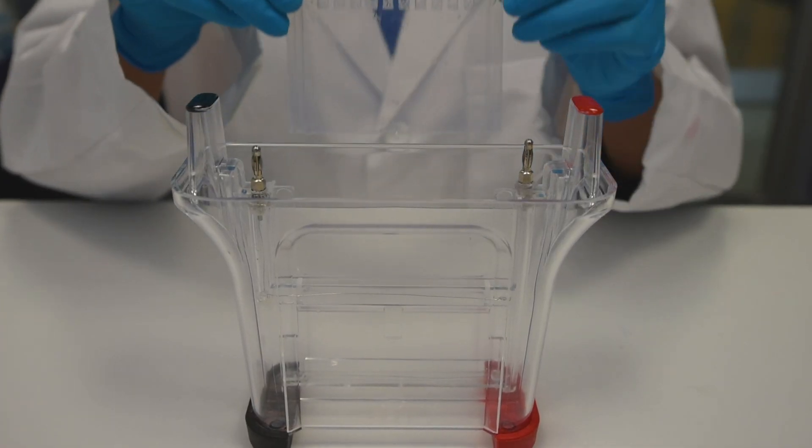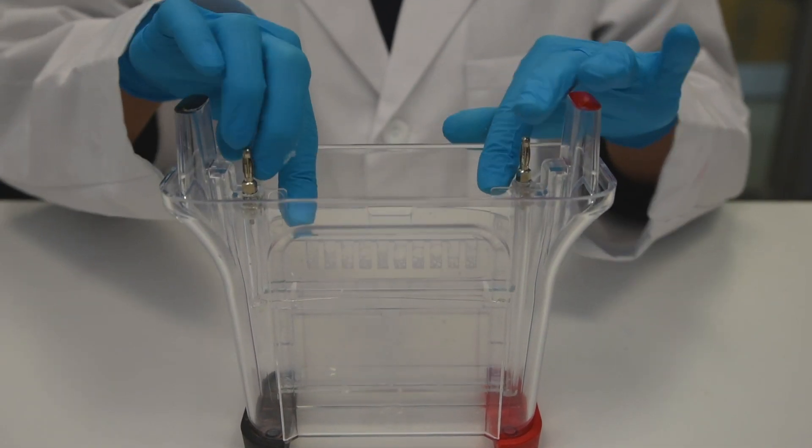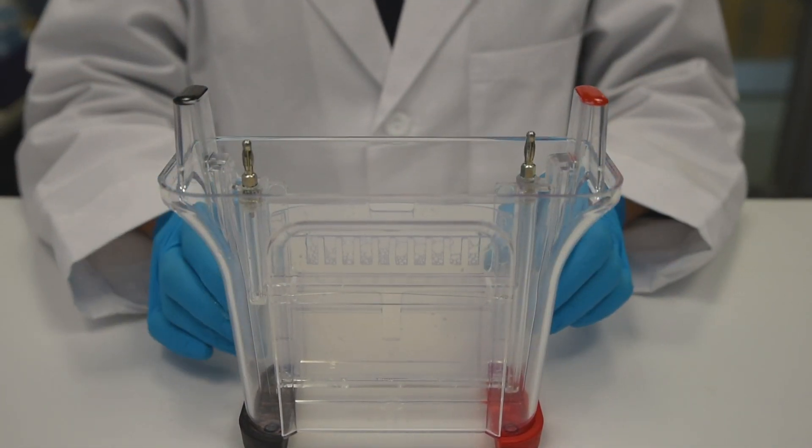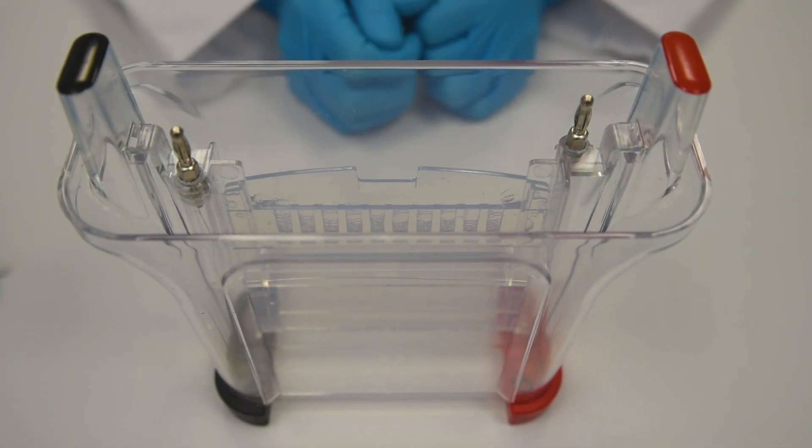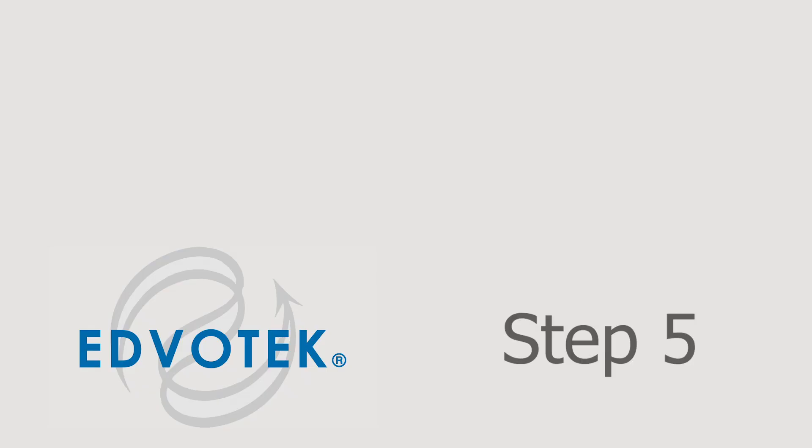Step 4: Insert the gel into the electrophoresis chamber. Orient the gel according to the manufacturer's instructions. For Edvotech vertical electrophoresis chambers, the short plate should face the interior.